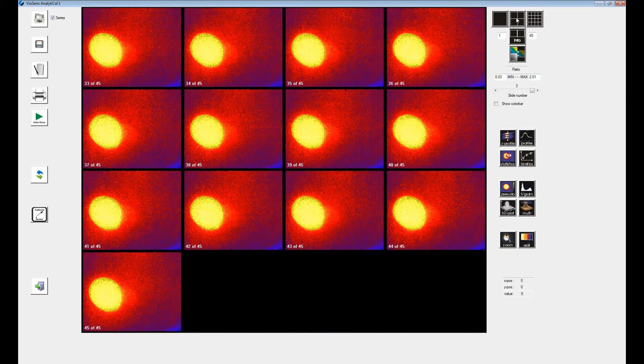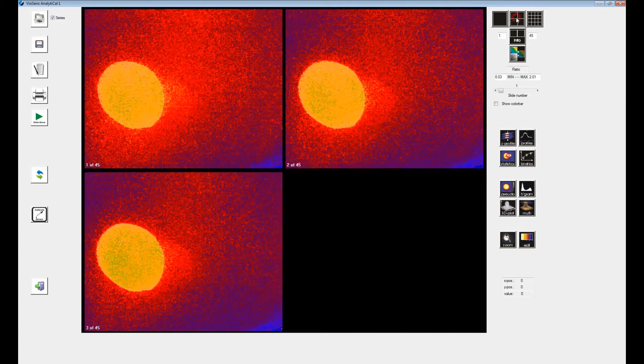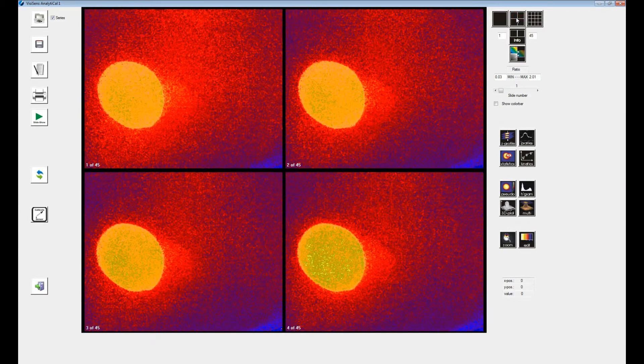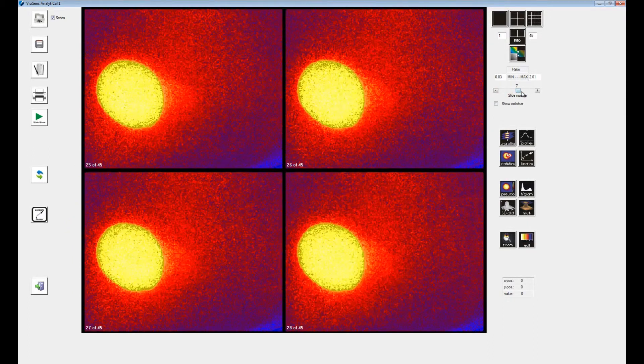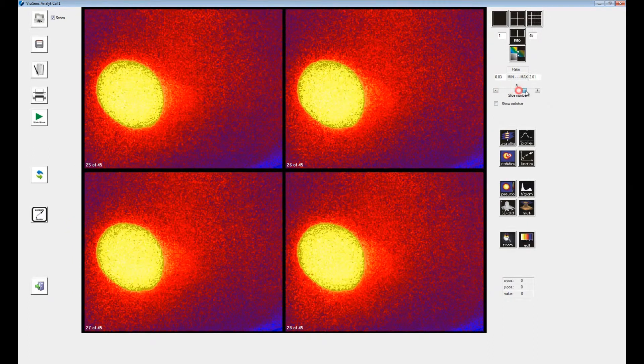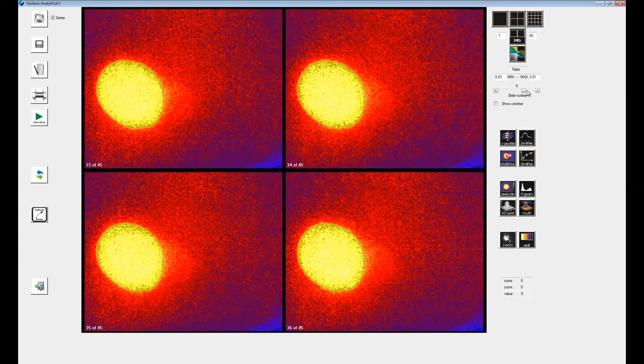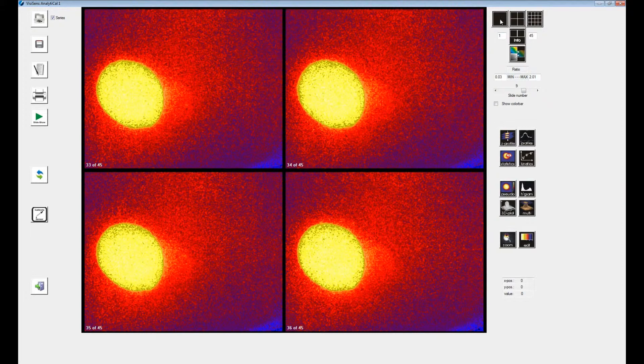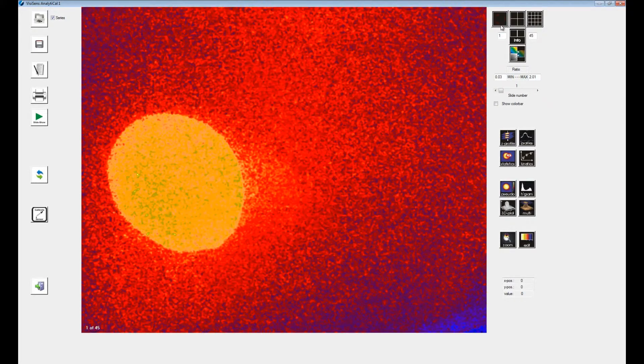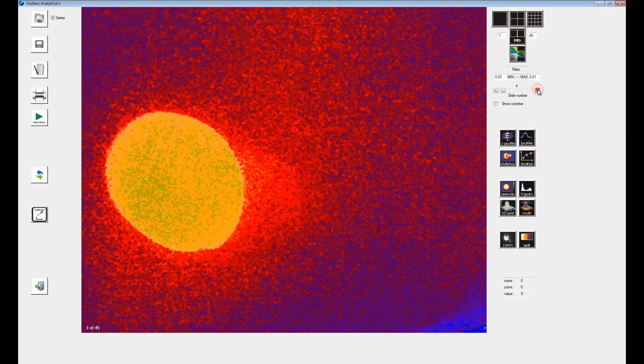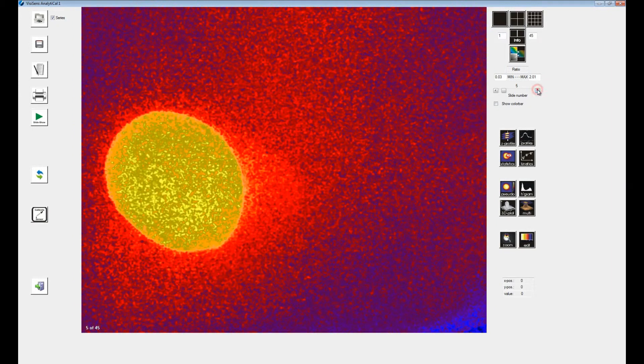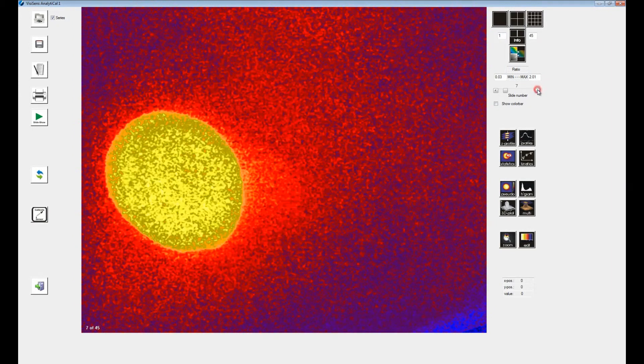You can also display 4 images at a time and again slide back and forth. Most of the time you might want to work with a single image displayed. Here you can also use the slide number bar to change to another image of your time series.